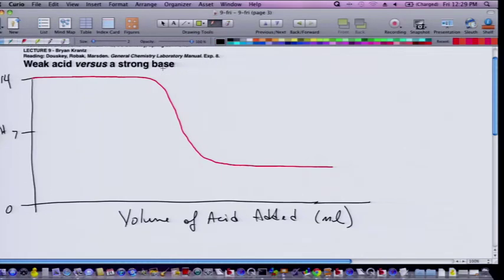So you can see that now, well, you have your equivalence point somewhere in there, and obviously the best choice here is going to be phenolphthalein, because that's going to titrate appropriately in this experiment. You start at high pHs, you'll transition right through pH 9 quite nicely, and hit the equivalence point. Okay.